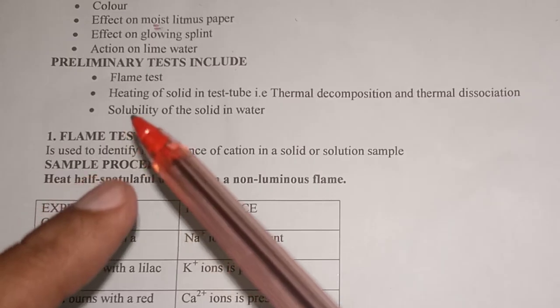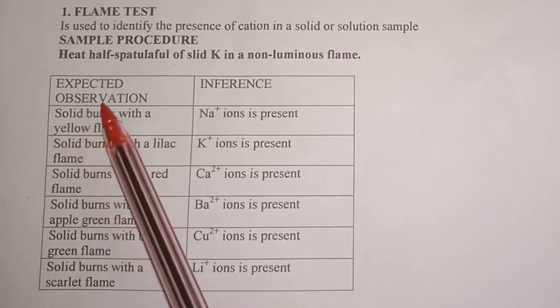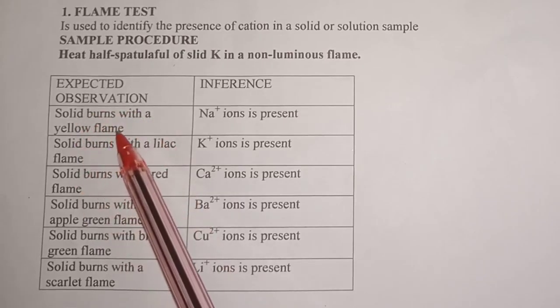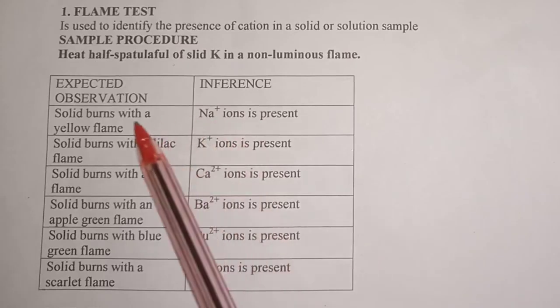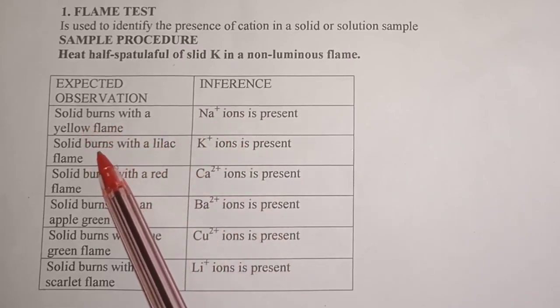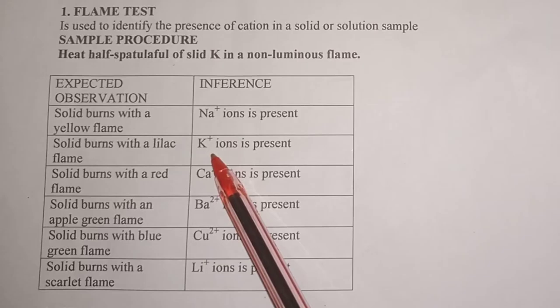The flame test that you make here depends on the cation present in that sample. So the expected observation here can be: solid burns with a yellow flame. The inference, the conclusion, becomes sodium ion present. Why? Because sodium salts burn with a yellow flame. Or it can be: solid burns with a lilac, that is purple, flame. The cation present here is potassium ion.